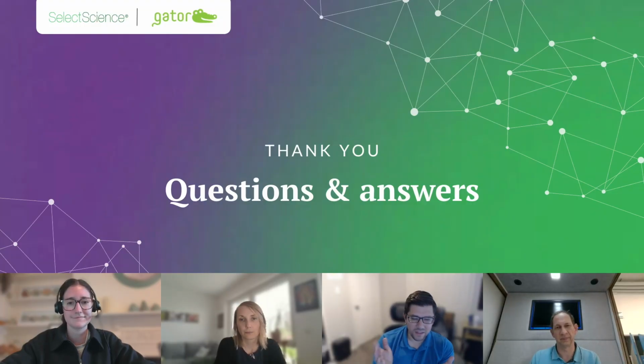Exactly. Yeah, and it depends on the kind of experiment you're running, right? Ron was explaining if you're doing a proper kinetic characterization of your molecules, 300 a day is a very reasonable and very high throughput number, frankly. But if you're just doing basic screening type experiments, single point, just doing quick measurements, you can squeeze in far more because the experiments are faster. You're looking for quick yes/no data instead of a controlled specific experiment where you're trying to really nail down a real KD value.